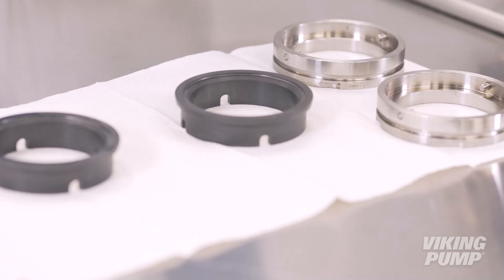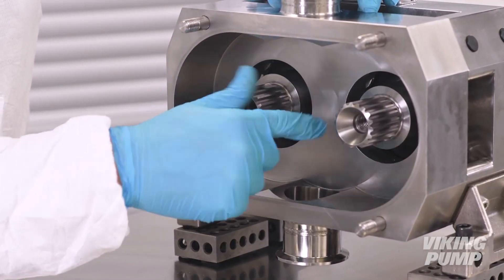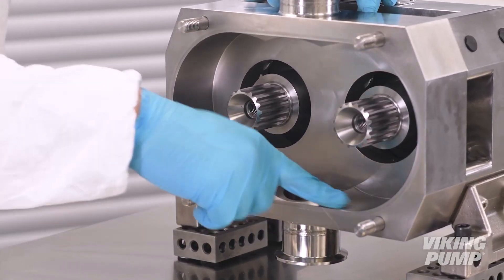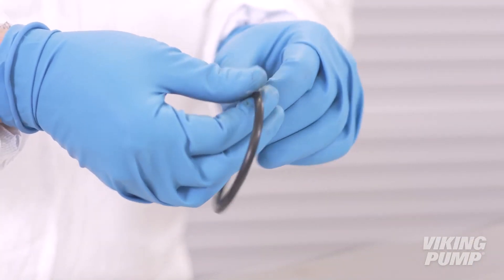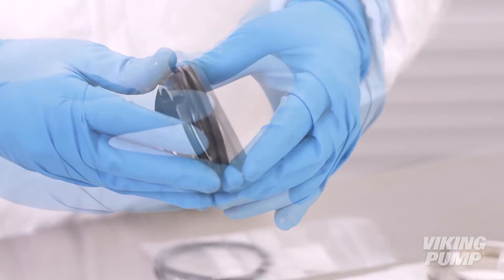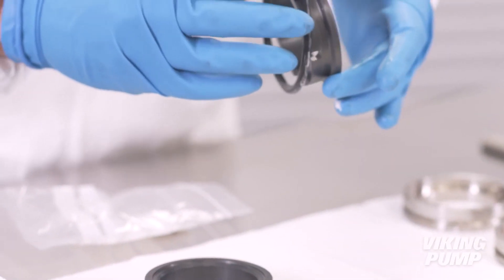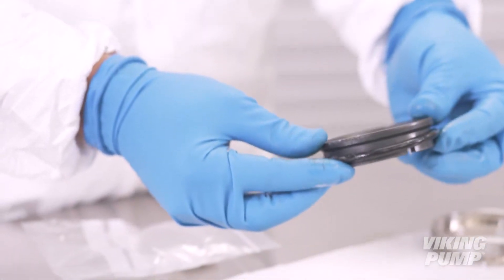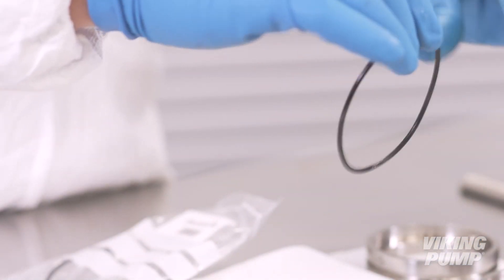Install new stationary seal assemblies. Start by inspecting the rotor case bore to make sure it is clean and free from debris and damage. Lubricate and install the seal face o-rings. Lubricate and install the seal housing o-rings.